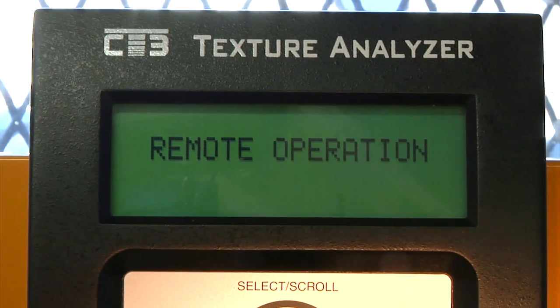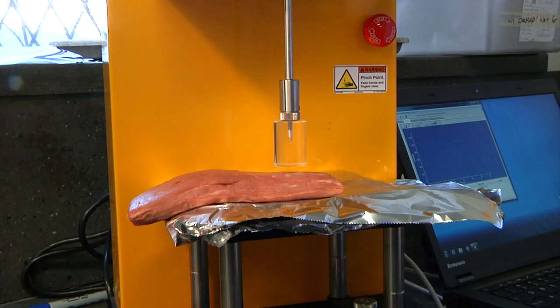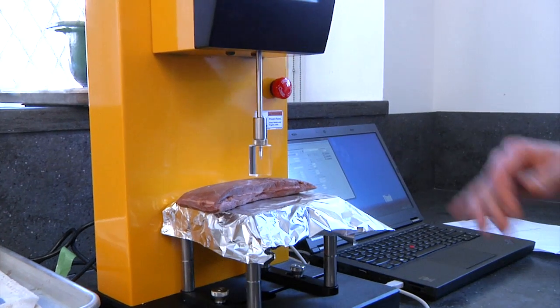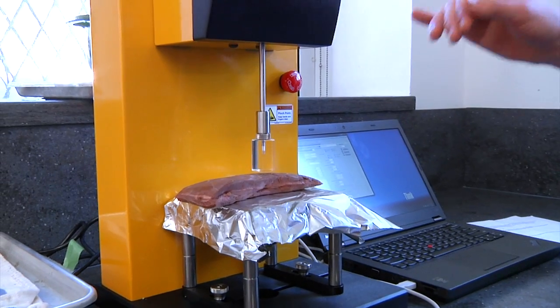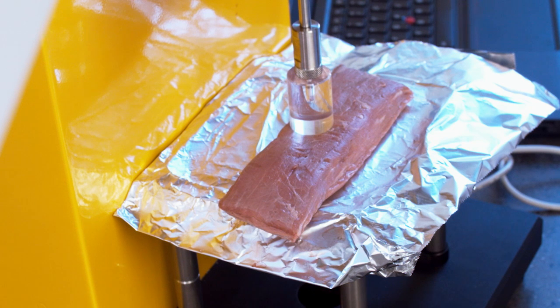Absolutely. So right now I'm working with a texture analyzer. This is from Brookfield Engineering, which is right here in Massachusetts — they lend us equipment from time to time, which is excellent. Right now I have a piece of flank steak; this specific one is cooked to 130 degrees. What we're testing is a range of temperatures to see at which point we find it to be the most tender.